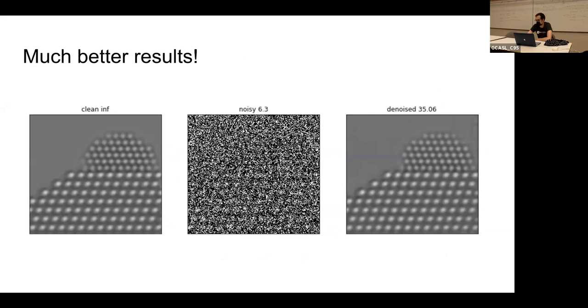It's actually, in my opinion, pretty insane that it is able to do this with these noise levels. Notice that it's not completely perfect. You have some artifacts. Yeah, actually, Carlos, I forgot to change these images. These are the models from last November, and right now they are much better. But it's okay.